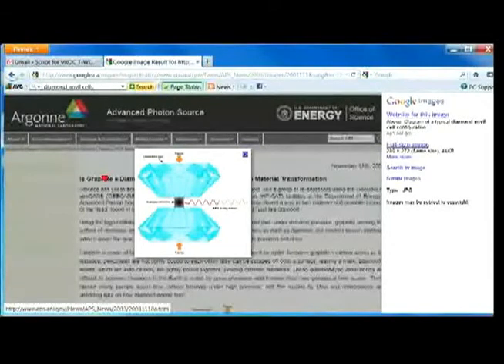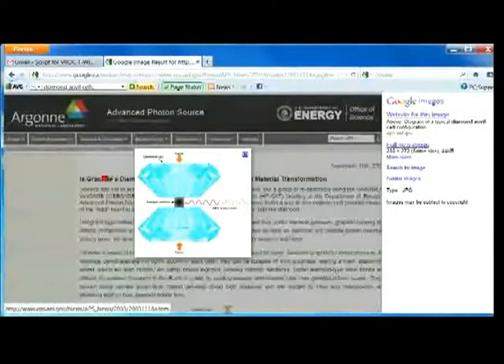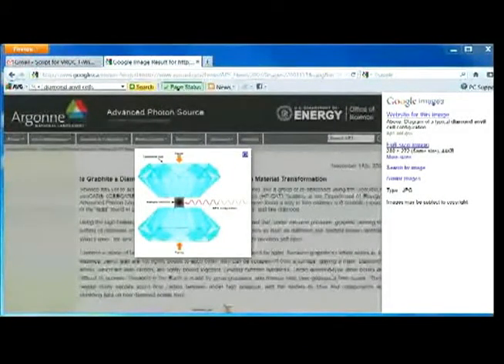The idea of this kind of research is that we cannot go into the deep of the earth. So what we want to do is mimic what happens with these rocks and minerals inside our earth. We generate this high pressure, and in this way we learn all the properties of these minerals, like physical properties and crystalline structures, how the atoms are arranged in their lattice, and how this material can be transported or have different phases. So yeah, it's a pretty cool technique and very interesting.